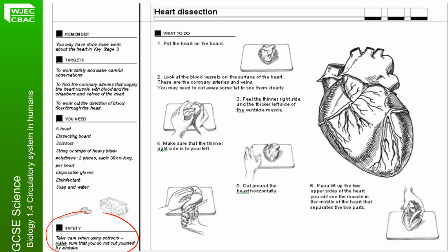In actual fact, a blunt knife is more dangerous than a sharper knife. I know with a sharper knife you're more likely to cut yourself, but a blunt knife tends not to go through the meat as easily, and so that's when the knife may slip and you end up cutting yourself. If you are going to do this, then please ask an adult if it's okay to do it in the house.